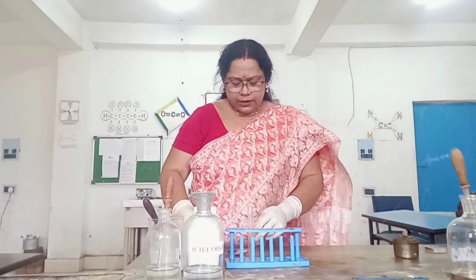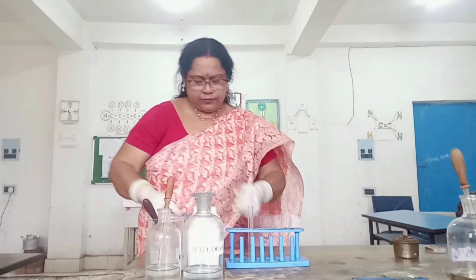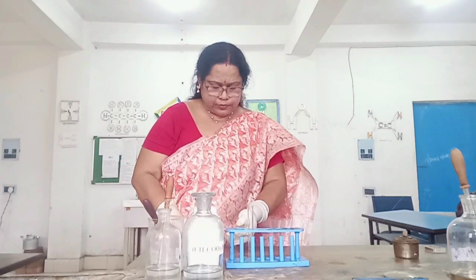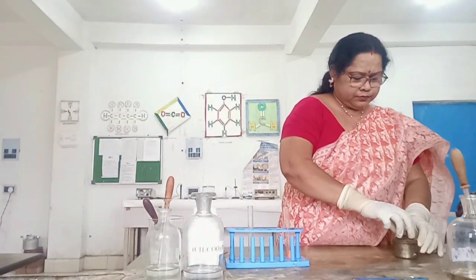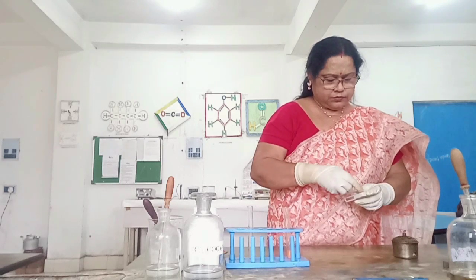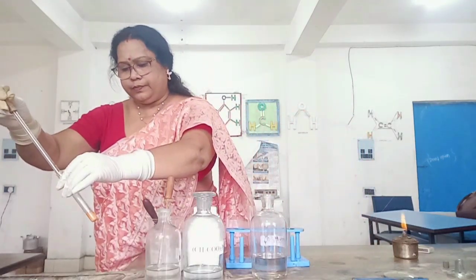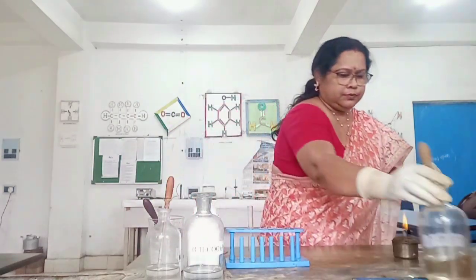Now transfer it into the test tube. Add concentrated H₂SO₄ and heat the mixture.